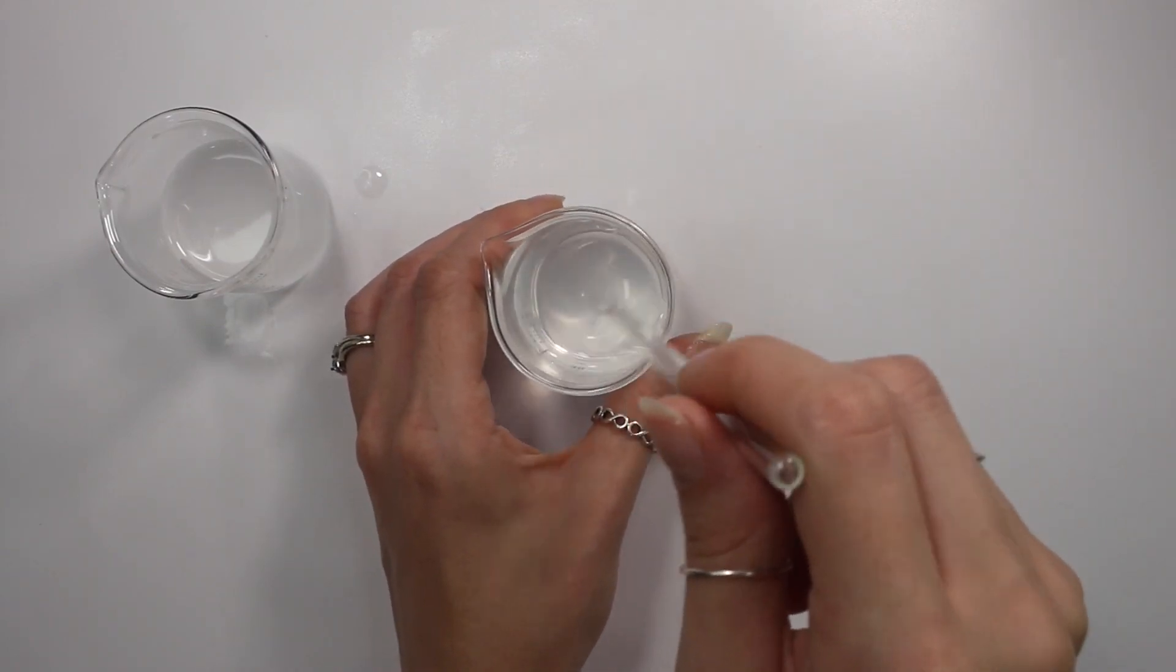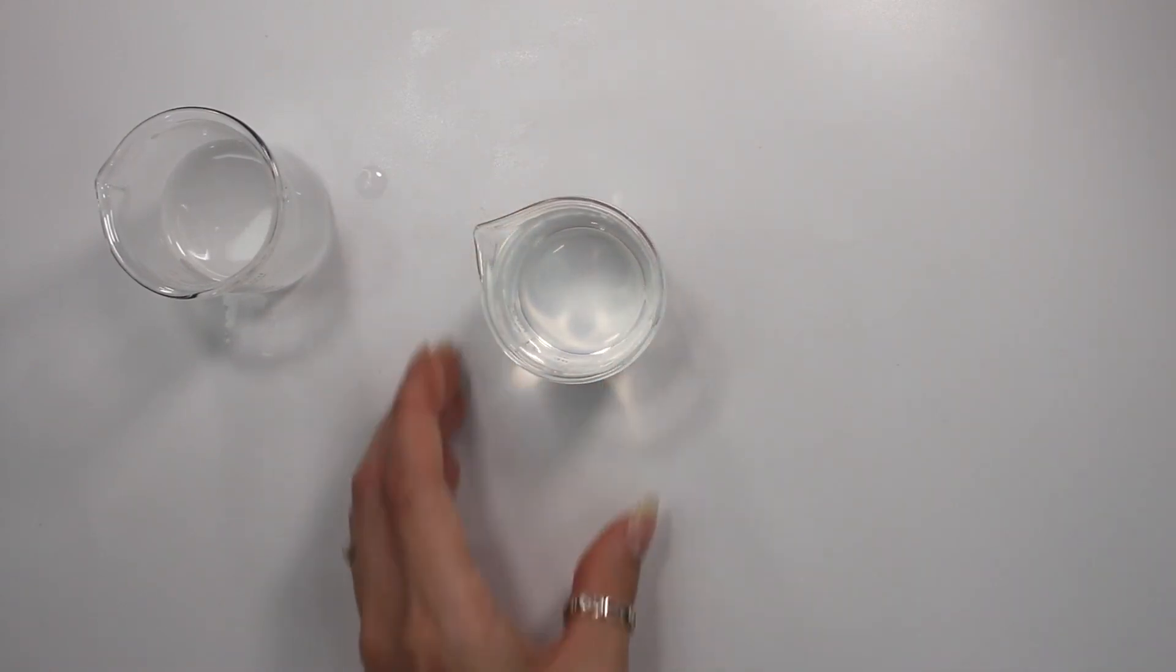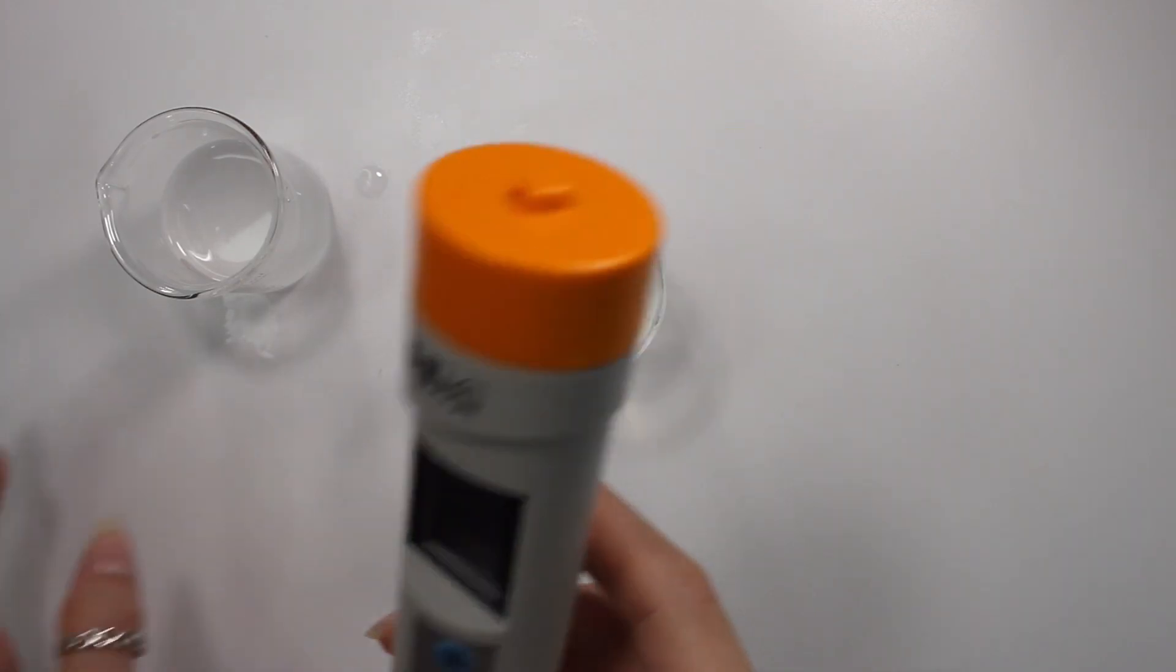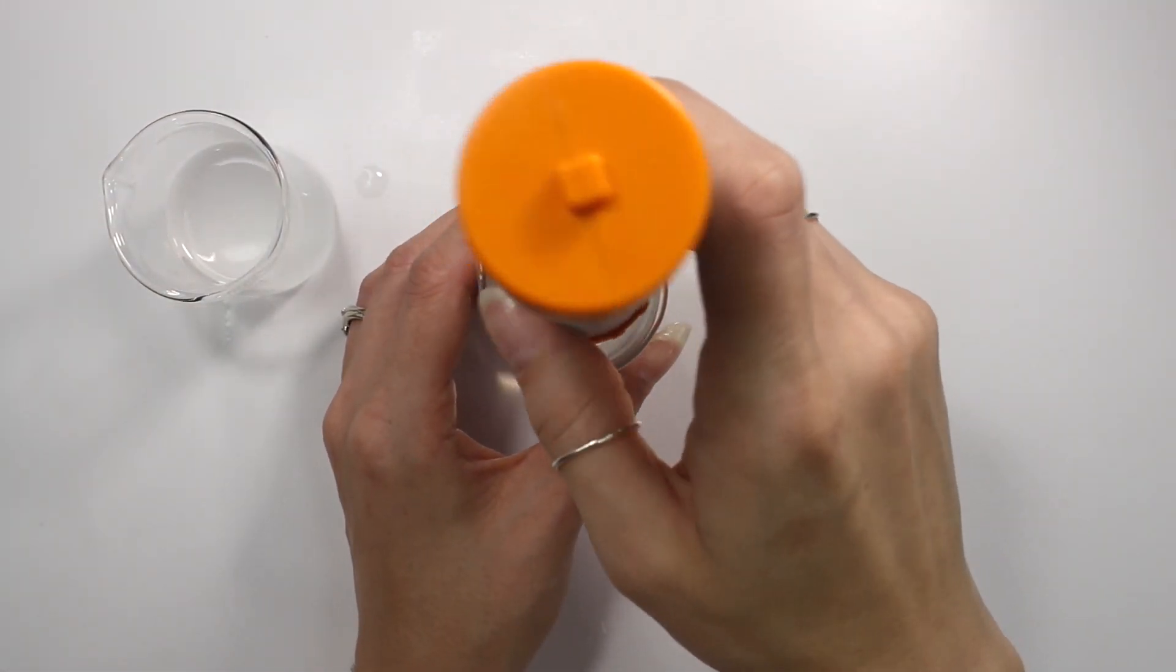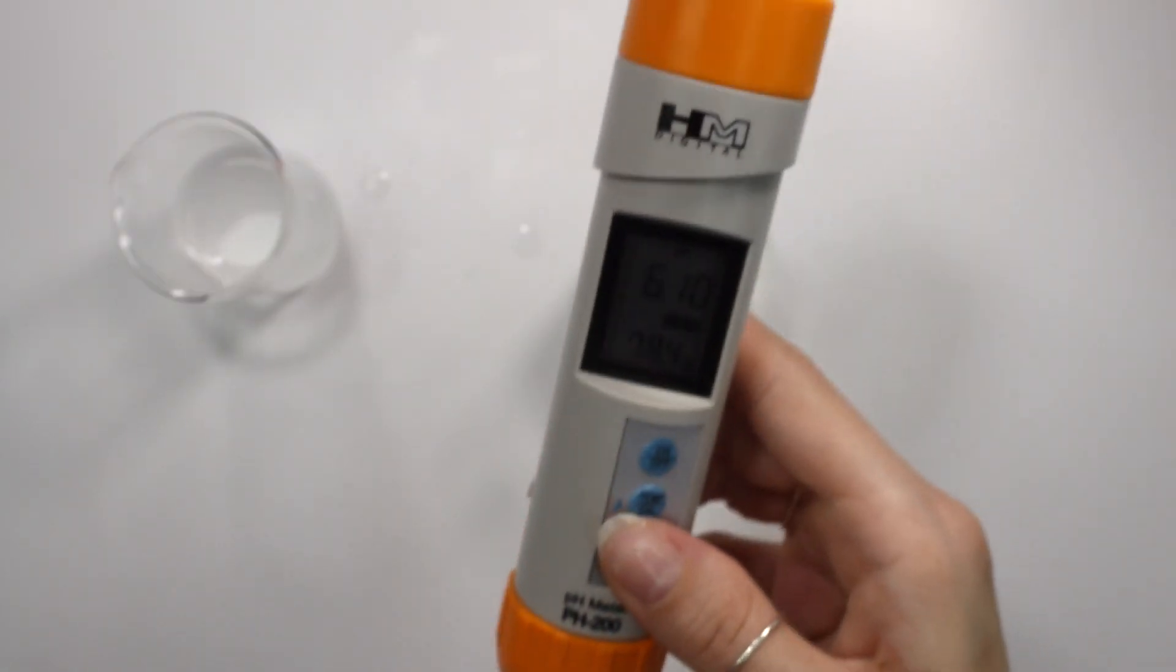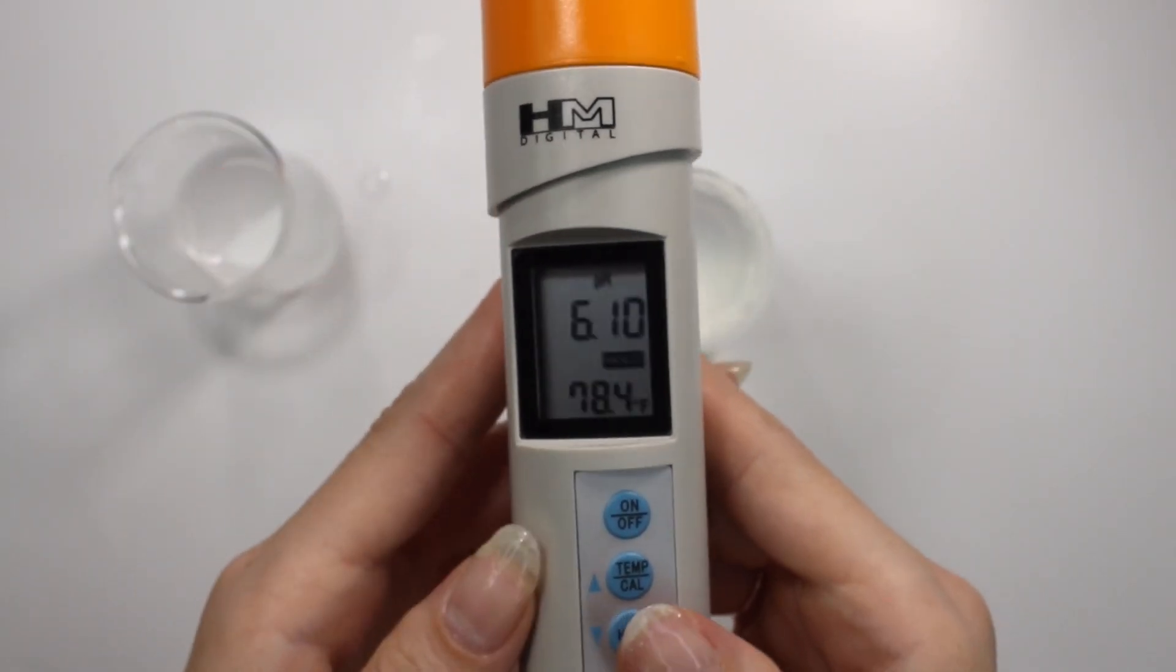So next we're going to take a pH reading of our diluted serum solution. Of course, I'm taking the more expensive pH meter first, rinsing it in my distilled water, and then swishing it around in the diluted serum solution for about a minute. And this one is reading a pH of 6.10.